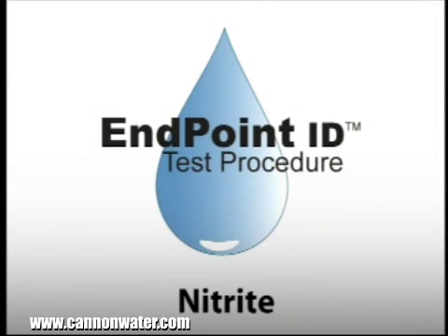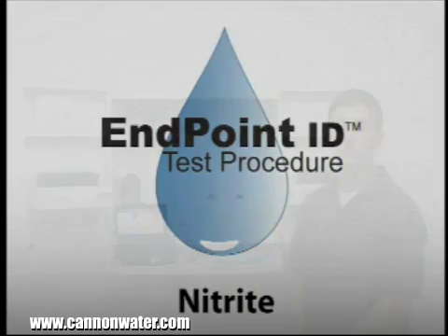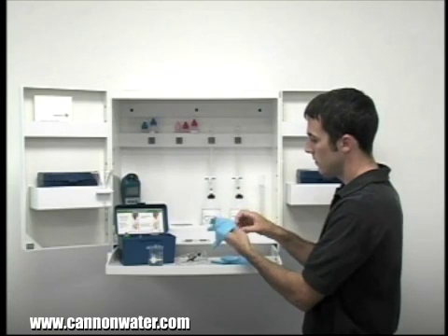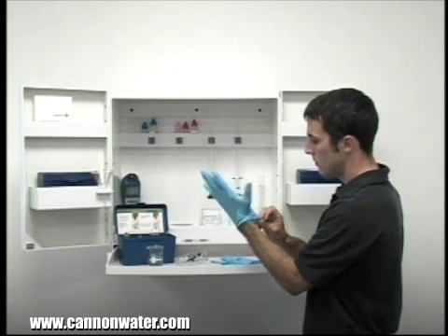This is a demonstration of a nitrite drop count test kit using endpoint ID procedures. Any time you're about to handle chemicals, you need to wear the proper safety equipment. In order to perform a drop count test, gloves and safety glasses are required.